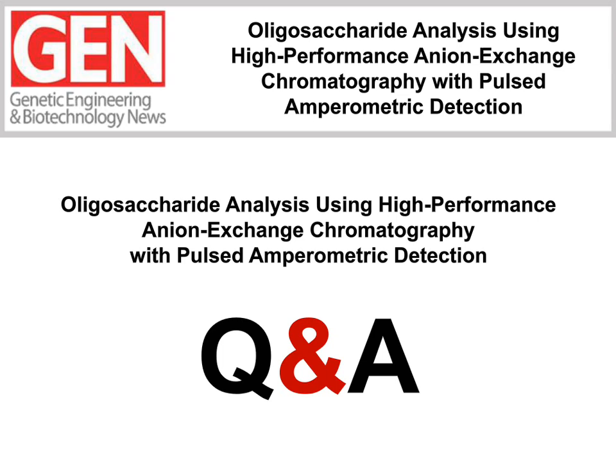In fact, I think it's almost 20 years ago, scientists at Amgen showed that you can get some different selectivity when you separate sialylated oligosaccharides, N-linked sialylated oligosaccharides with no hydroxide in the mobile phase, and then adding the hydroxide afterwards for the detection.